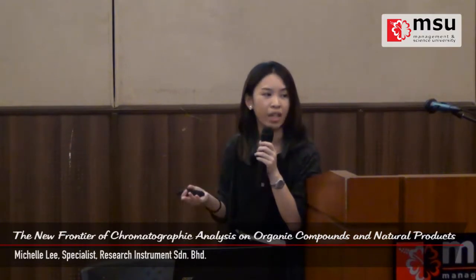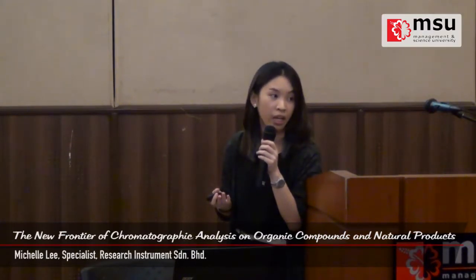So if you use this kind of natural product and go for HPLC, you have a lot of peaks, and because those components are unknown to you, there is no standard either. So the bunch of peaks doesn't give you any meaning. But if you run the very same sample on HPTLC, at least it gives you a fingerprint, and then you can match it to some reference fingerprint.